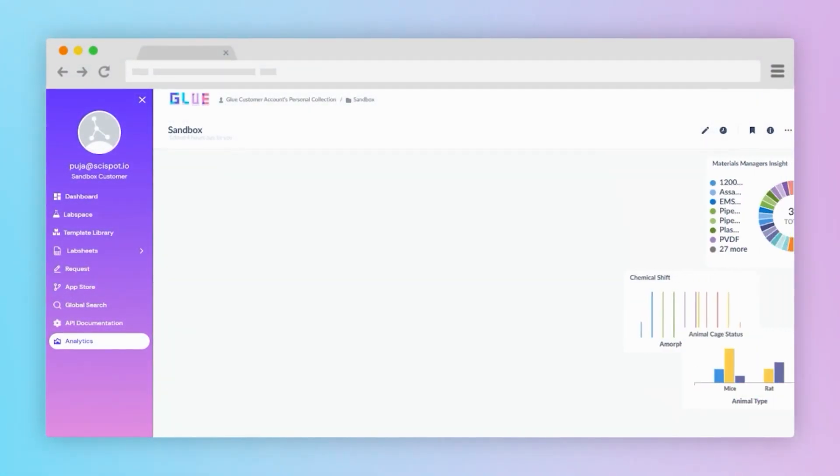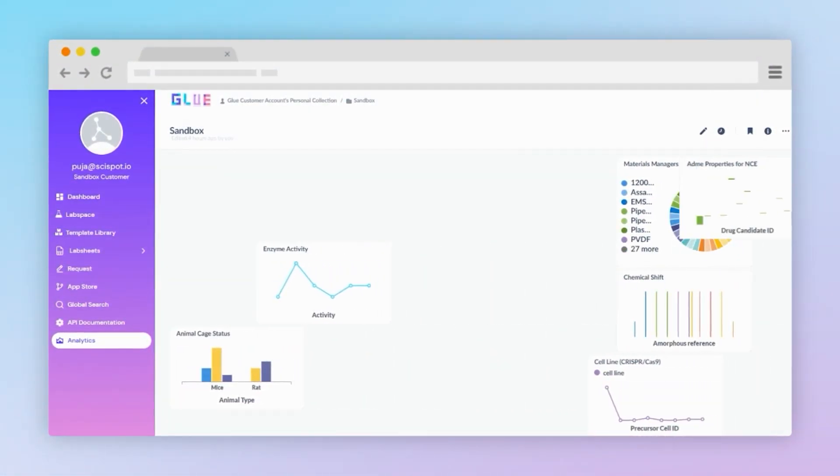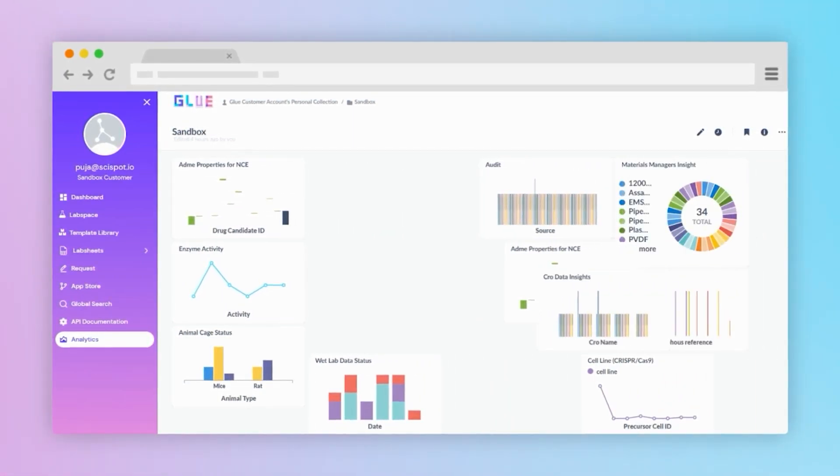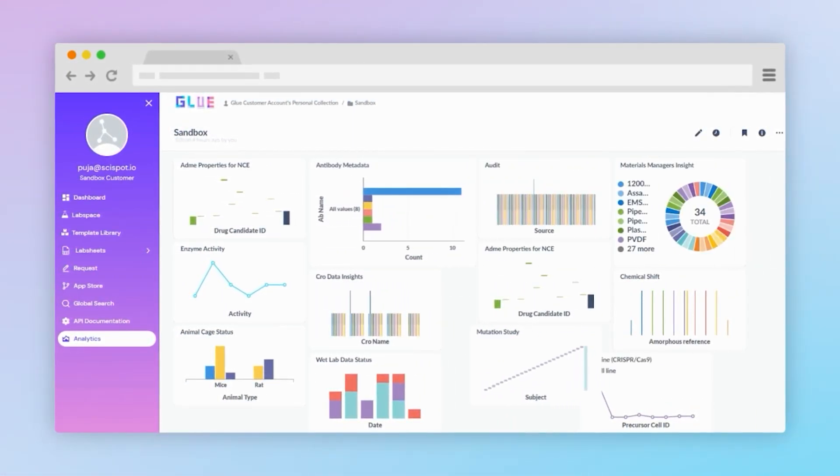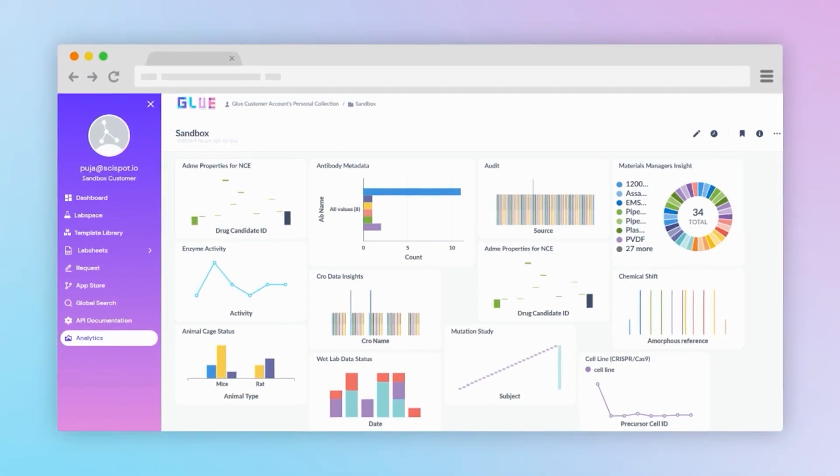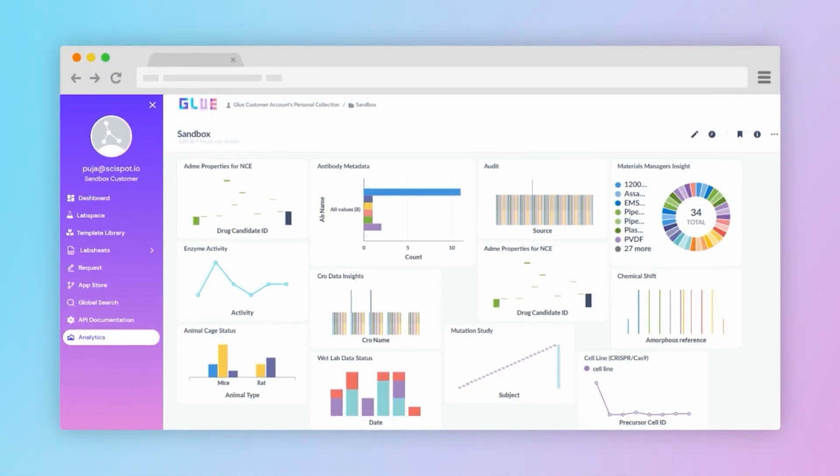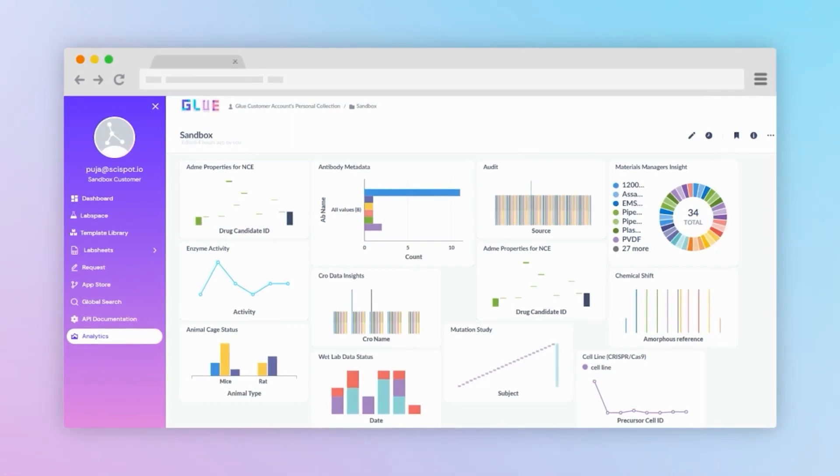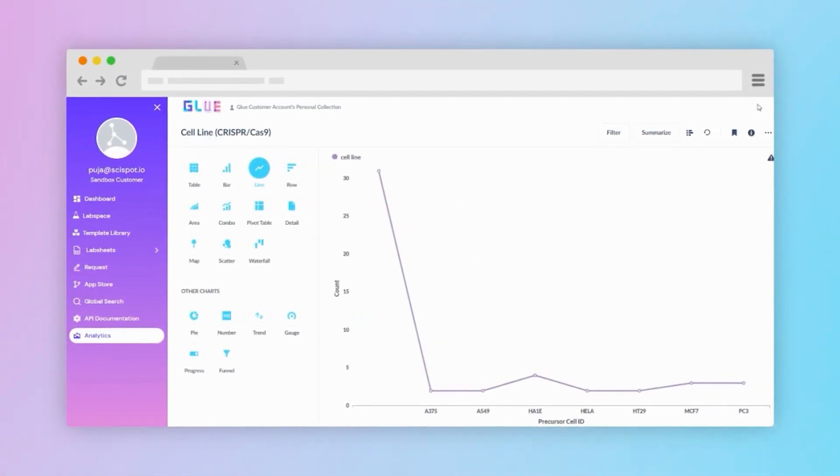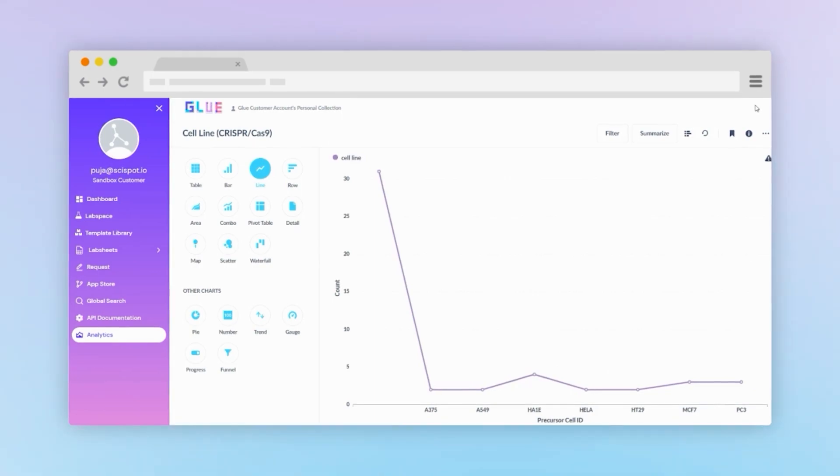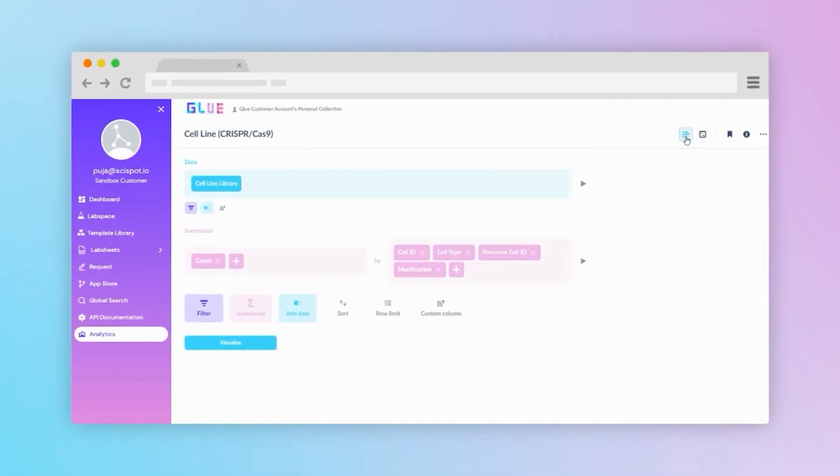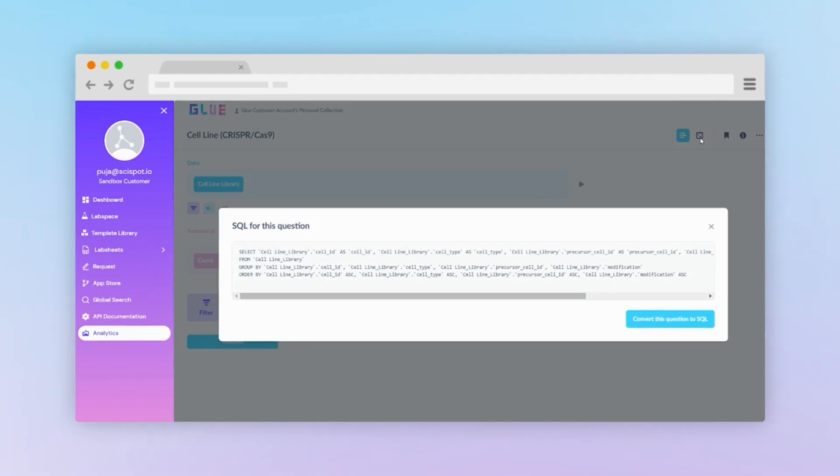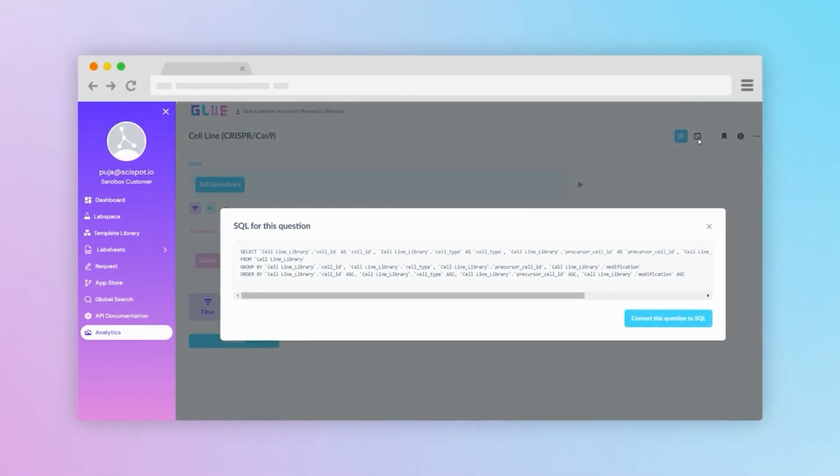Drawing the right insights from the data you are creating is an important aspect of science. We are in it with you. SciSpot's analytics tool is a powerful feature that enables the creation of customized dashboards and graphs based on stored data. Users can easily create different visualizations out of the metadata, customize visualizations, and run SQL queries to tailor the analysis to specific use cases.